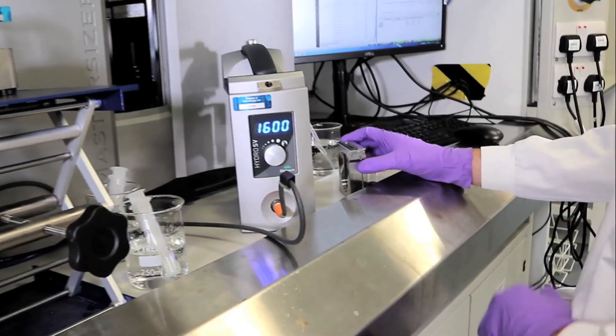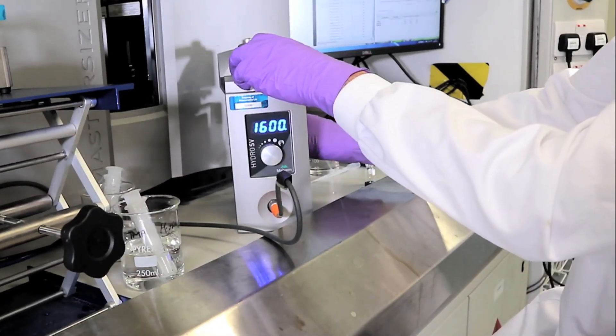Using our in-house technology, we can develop particle sizing methodology using wet or dry infant materials on our Malvern Mastersizer 3.